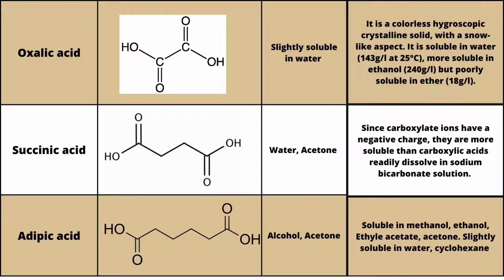Adipic acid, structural formula: solubility in water, alcohol, acetone. Solubility in 10% NaHCO3: soluble in methanol, ethanol, ethyl acetate, acetone, slightly soluble in water, cyclohexane.